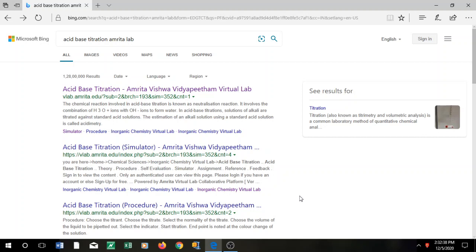as virtual lab. Now today in this video, I'll explain one of the titration methods because normally in chemistry, especially in engineering chemistry, when you start your chemistry lab, it always starts with a titration session. So today I'll explain to you how titration can be performed. So obviously in the keywords you have to type acid base titration or any titration and Amrita lab.